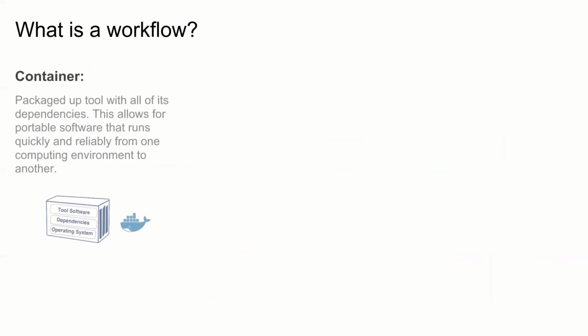So, what is a workflow? At a high level, it can be broken into three parts. First is a container. A container is a lightweight virtual machine compiled with specific tools and specific versions. This provides the consistency across groups running a workflow. For all the work done by the HPRC in AnVIL, we use a container technology called Docker.